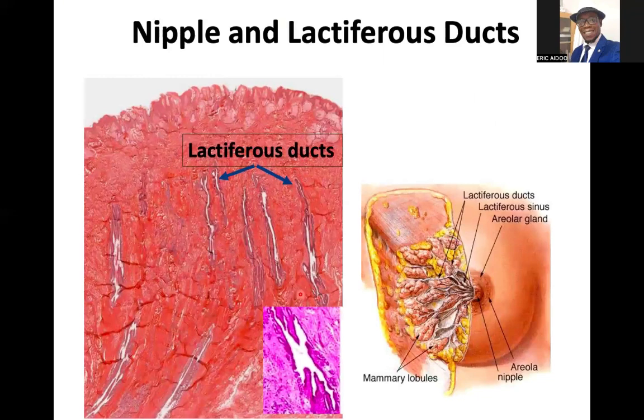So in a micrograph, you find something like this, showing the lactiferous duct with the lumen, which is not stained. So a similar thing is shown here. You might confuse this with the hair follicle, but note that this one is not containing arrector pili muscles here, and then you are also not seeing sebaceous glands attached to what looks like the hair follicles. Okay.